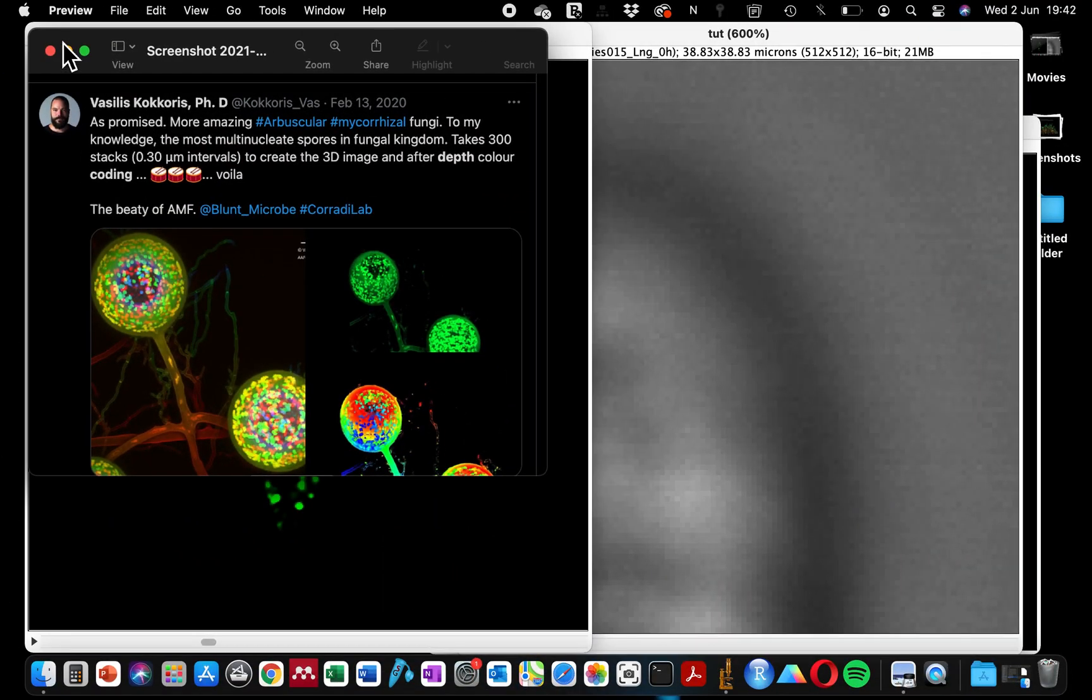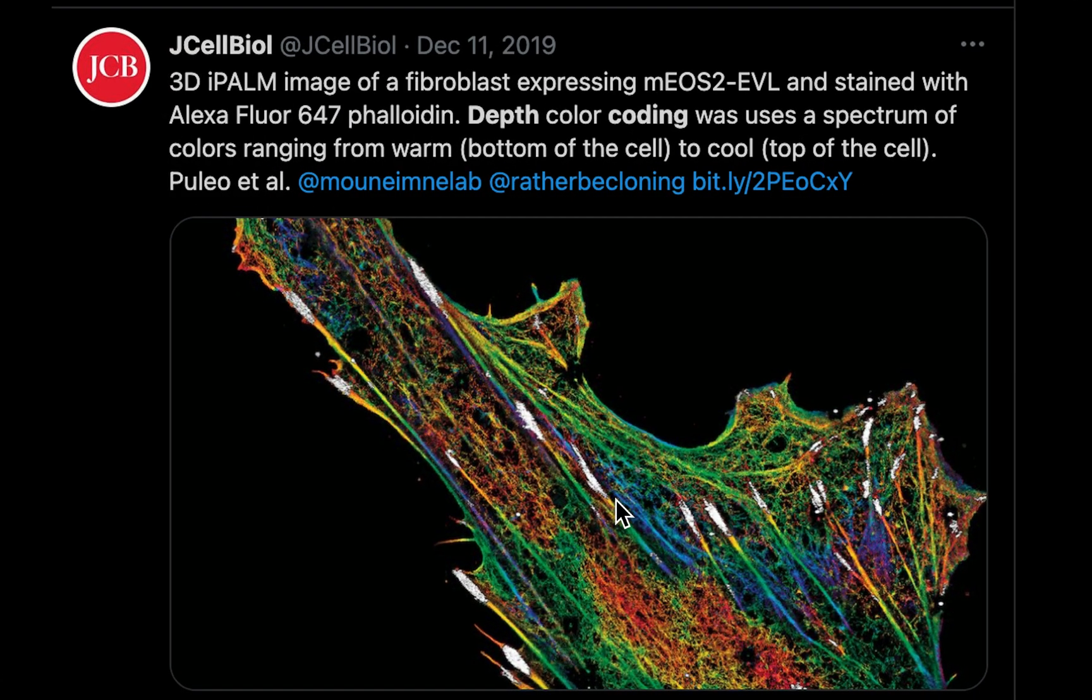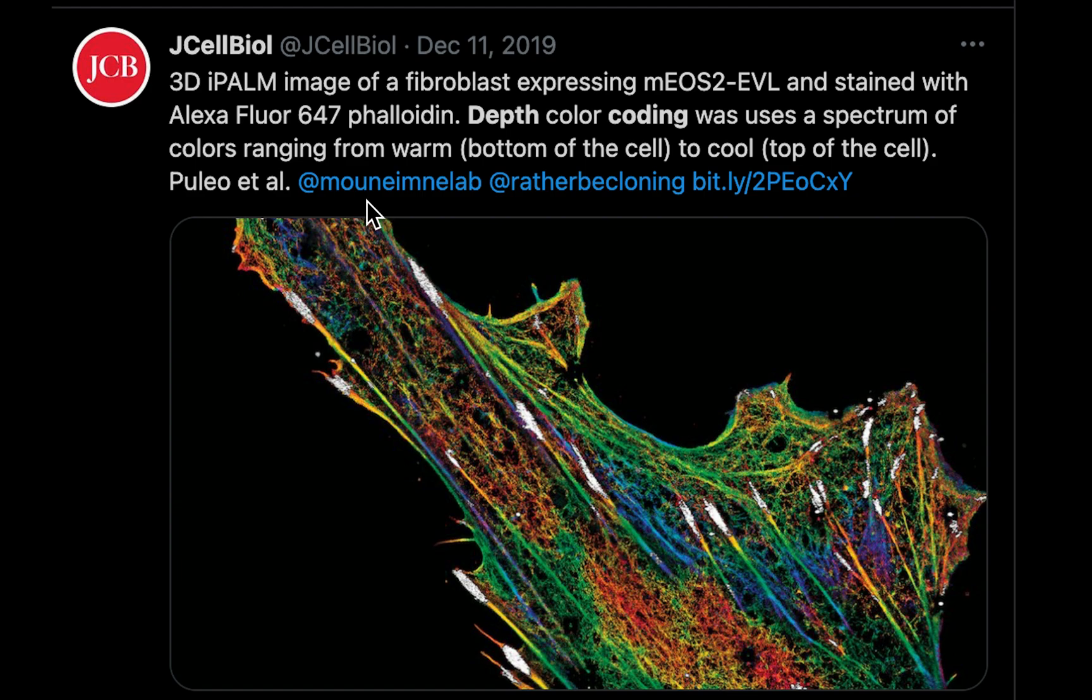There's another one I found from the Journal of Cell Biology. You can see this fibroblast cell. The different structures of this fibroblast cell are at different positions within the Z-stack, and that's why you could see some in orange, green, white, purple, and several other colors.